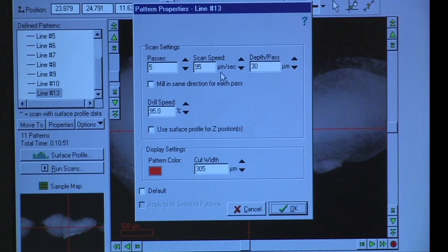Scan speed, the speed at which the drill passes through the sample. This is usually set between 10 and 65 microns per second. For fragile otoliths like Turbot, use the slower speed of 15 to 20 microns per second.